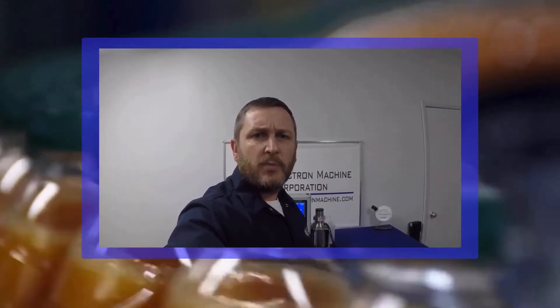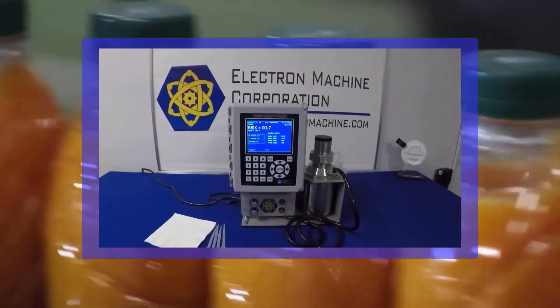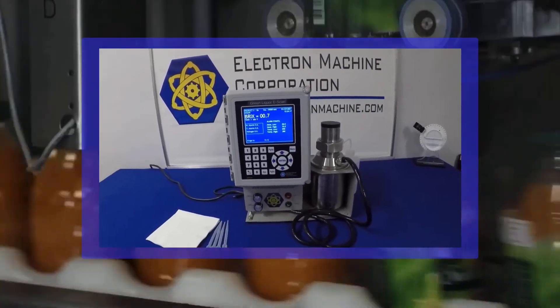Are you a juice manufacturer that wants better quality control while reducing cost? Stay tuned to see how this instrument can help you out.